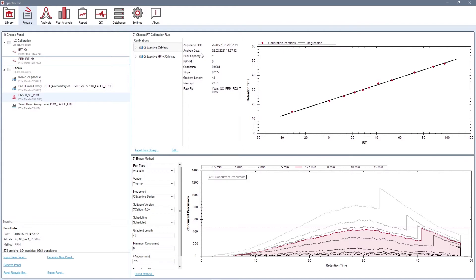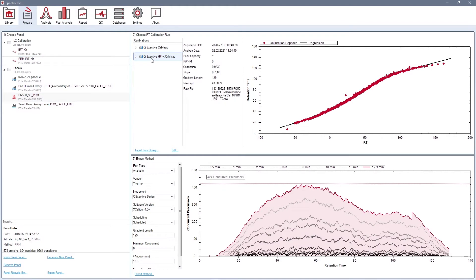You can use an unscheduled run or, second option, a scheduled run with a broader time window. Or the third option, our novel workflow that lets you import a calibration directly from a library that was generated using the same chromatographic setup as used for acquiring the target runs.